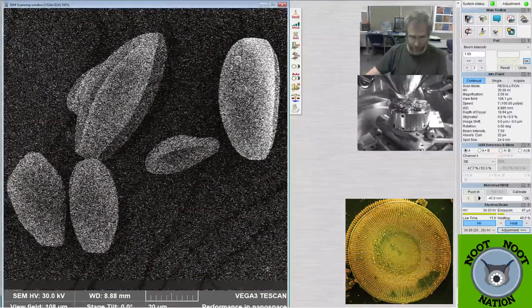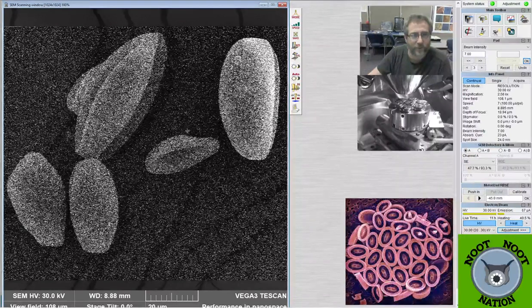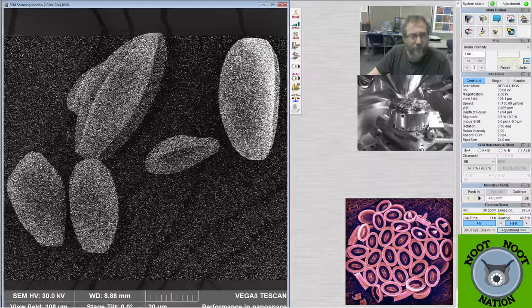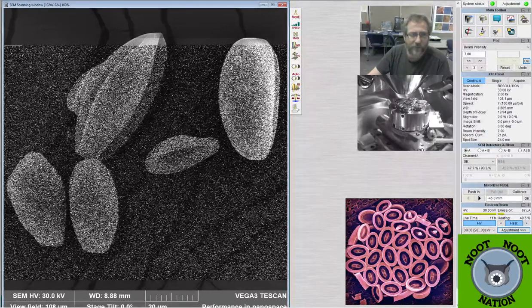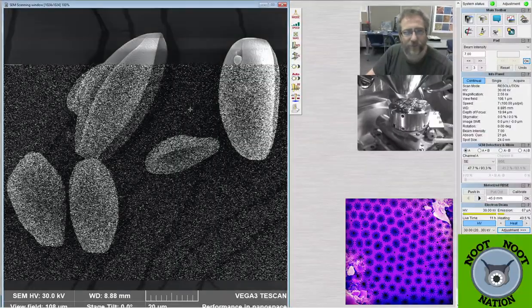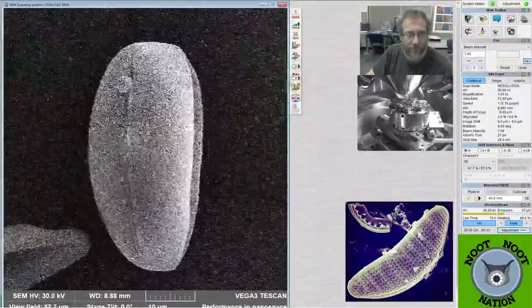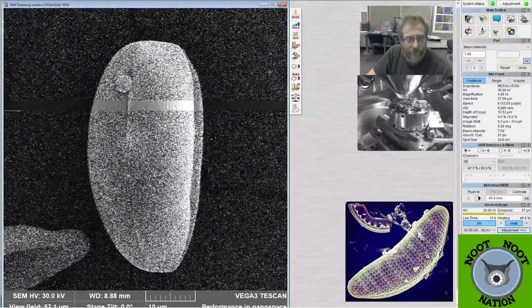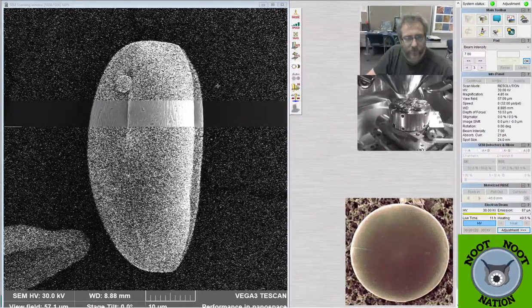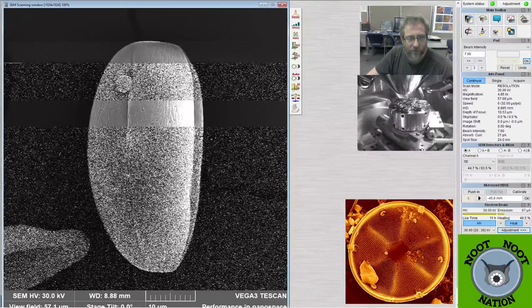This stuff that you're seeing in the background is just the carbon tape. So it has a dark color, and the big cracks are because it's in a vacuum, and it's basically caused the tape to pull itself apart a bit by desiccation. But it's just charging a little right there. Oh, it looks like it's charging a lot. Still kind of cool, but I don't want it all charged up like that. Let's see if I can make some adjustments. So it looks like it has really cool sort of swirls or whorls on the surface, like a fingerprint. Still charging right at the tip of it.